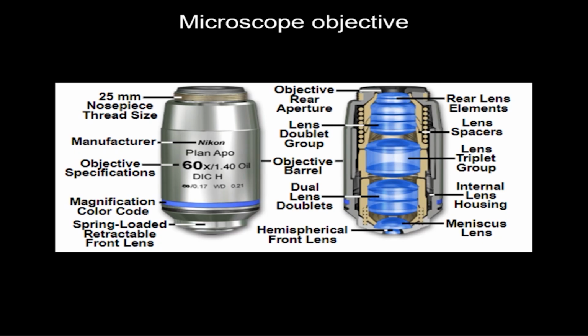If you take a cross section of the objective, you will see something like this. Somebody was asking about the corrections. If you take an objective like this, you will see this kind of information. The company, these are called Nikon.